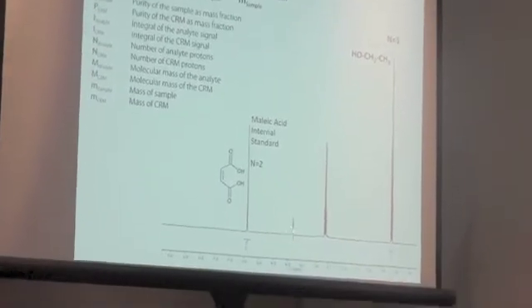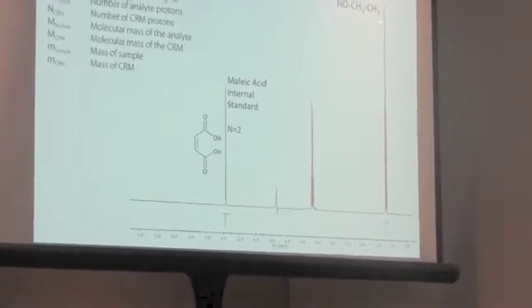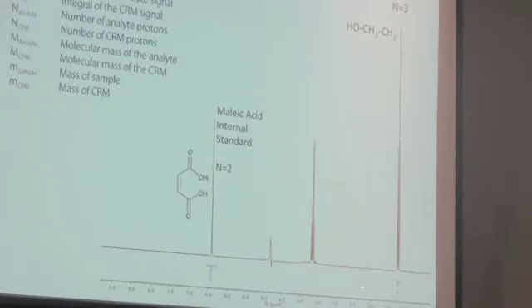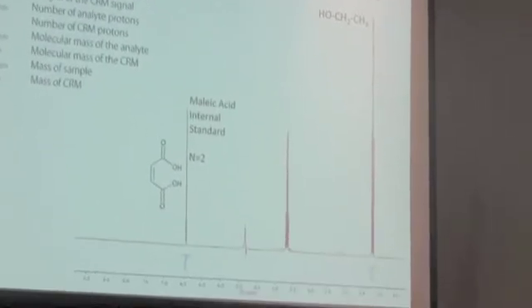So this distortion, when you're trying to see all this low-lying stuff, what I wanted to show is that when you kill that water peak, you start to be able to see all the interesting stuff in it. There's the ethanol that the TTB want to know about, but then all the other stuff in here is all the good stuff.